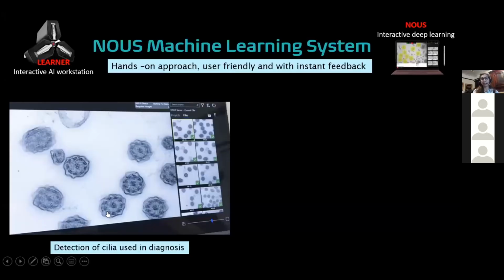So knowing this, we thought, if we know how to identify these defects, and they're fairly well conserved between cilia, why not use a machine that we can teach with these defects, with this normality versus abnormality, and see if it can learn, if it can give us a good prediction of a normal versus an abnormal cilia? To do this, we started with full images containing several cilia, collected in an electron microscope, and we started by detecting cilia.